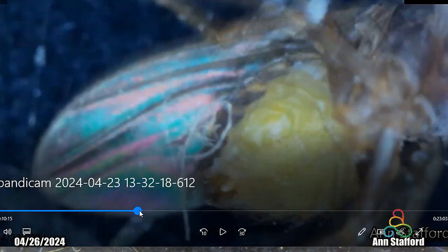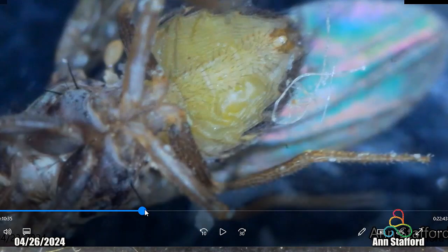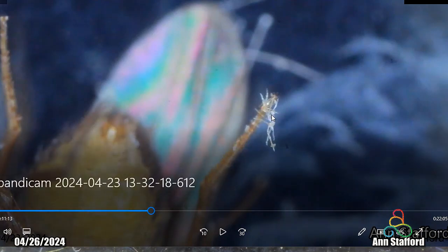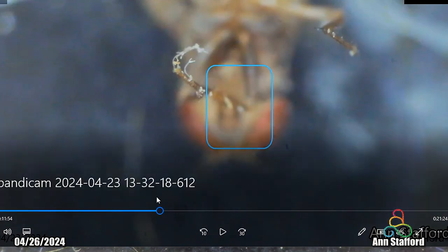Let me see. Here's the, oh Lord, buddy, you gotta be still. He moves so much. There's the hydras. There we go. Somehow he gets it on his hand here. Okay, so he has two. There's actually two. There's a dot here and there's a dot here. And at some point, they aren't so squished together. He also has something here stuck on his hand.